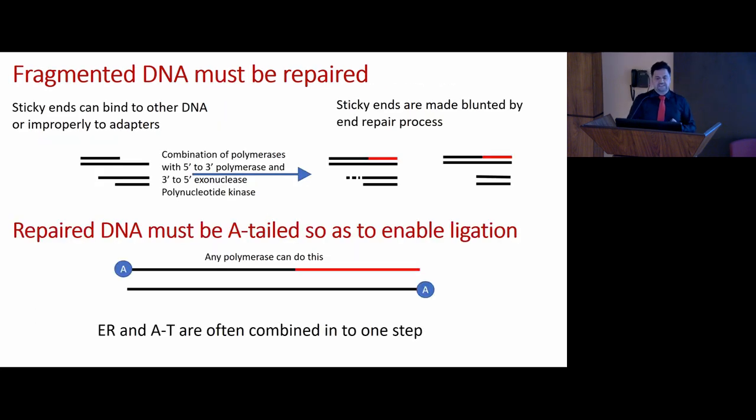Now what happened? The DNA got fragmented, but it is not fragmented like a glass vase falling to the floor. It doesn't fragment uniformly. One fragment will have this strand stopping here, another will have this strand stopping here. So you can see there are a lot of overhangs, and these overhangs are a cause of problem because they have to be repaired.